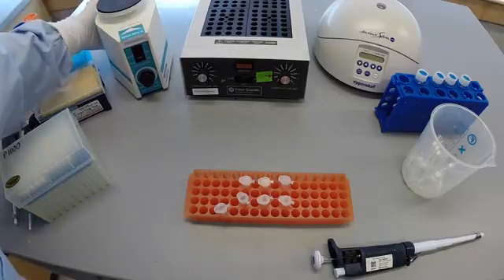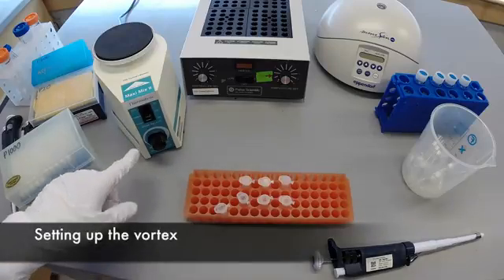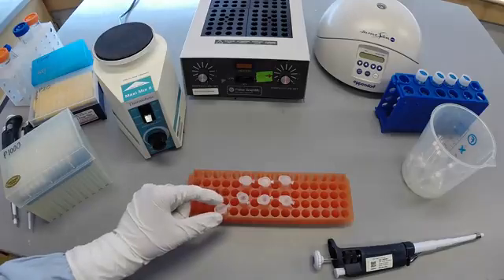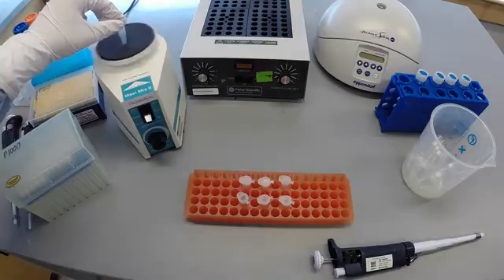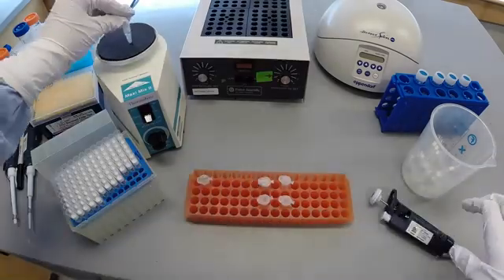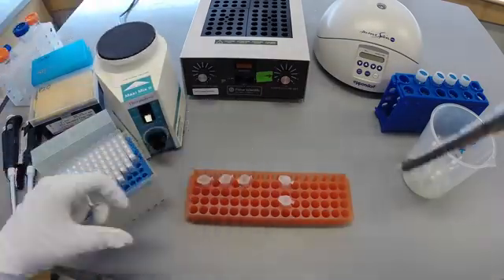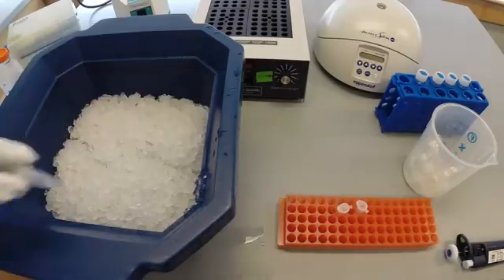Mix the solution with a vortex. To turn on the vortex, press the switch down to touch and turn the knob clockwise to ensure maximum speed. Hold one tube at a time and press the top of the black pad to initiate vibration. Repeat this process for all remaining samples. Embed all samples in ice for 10 minutes.